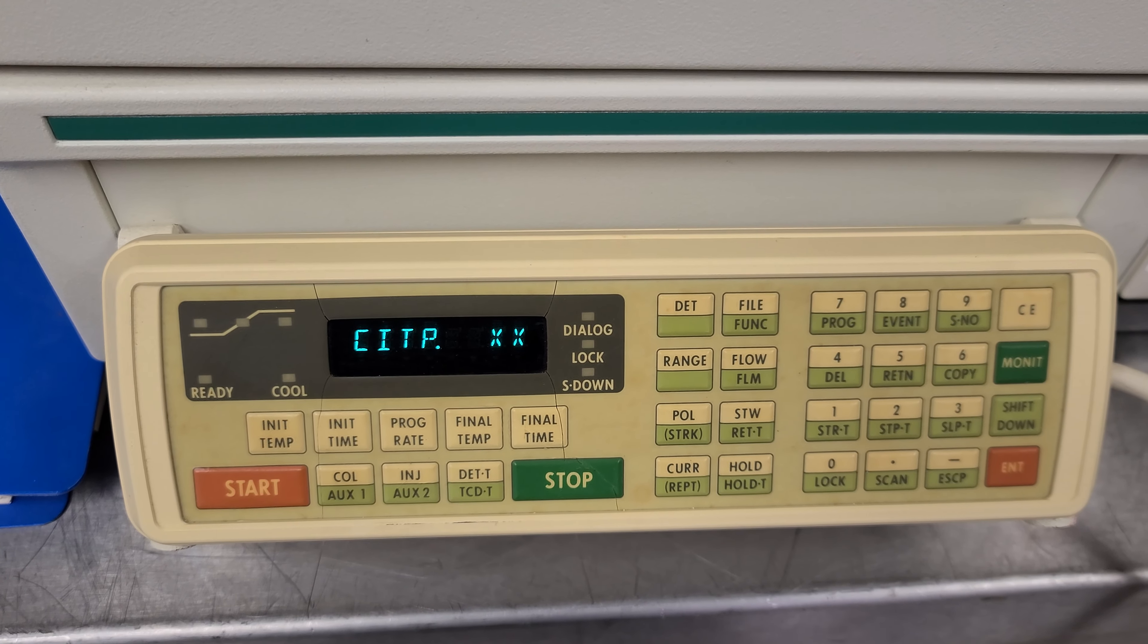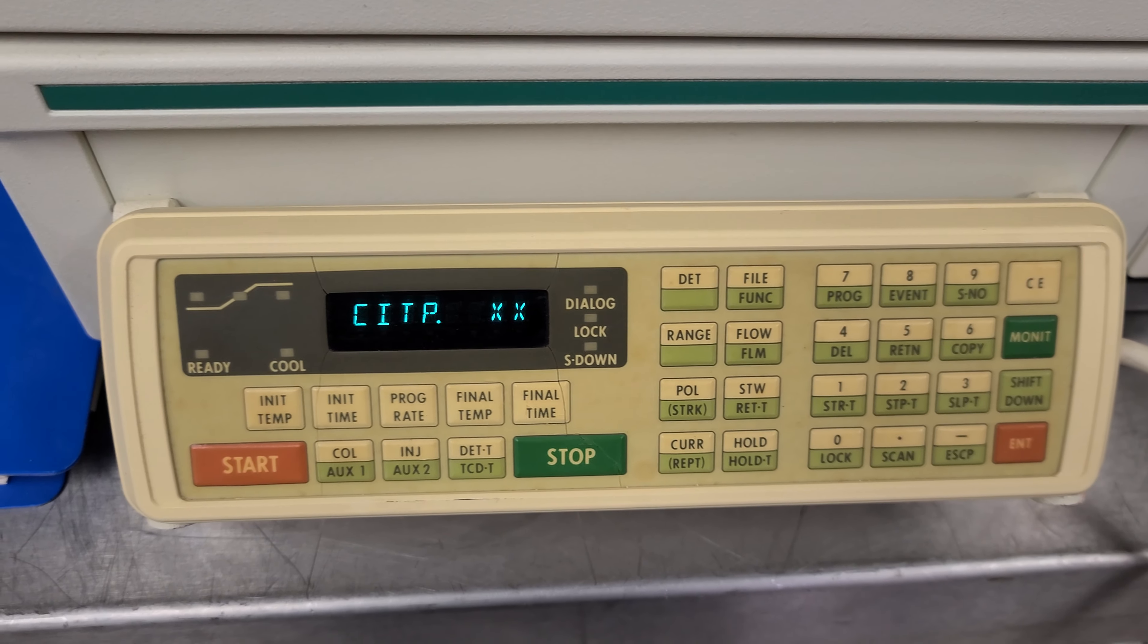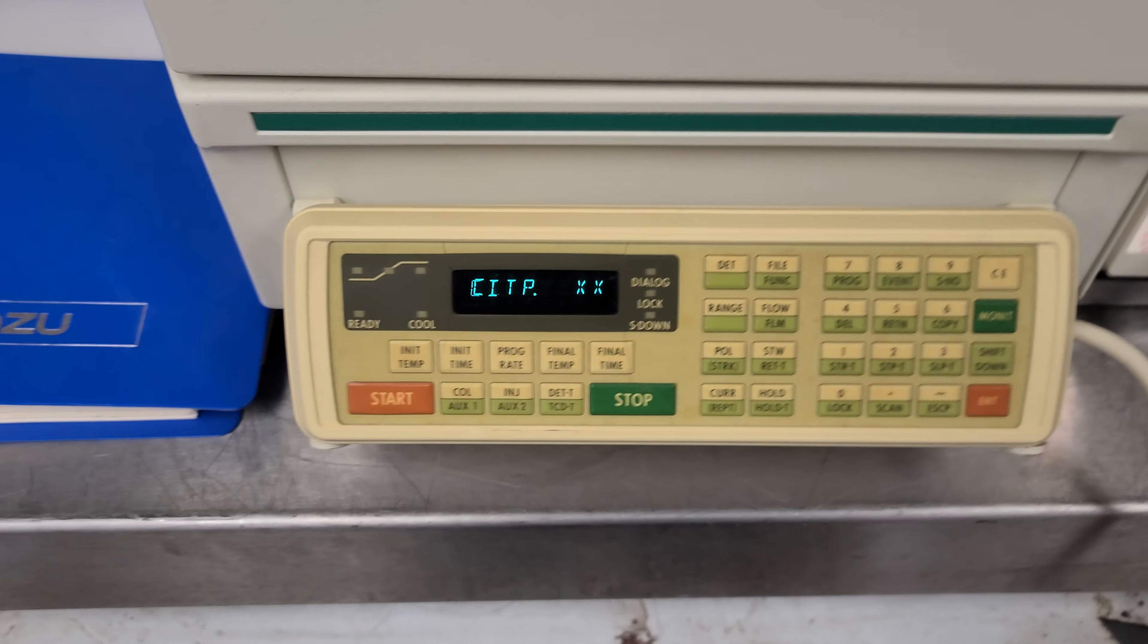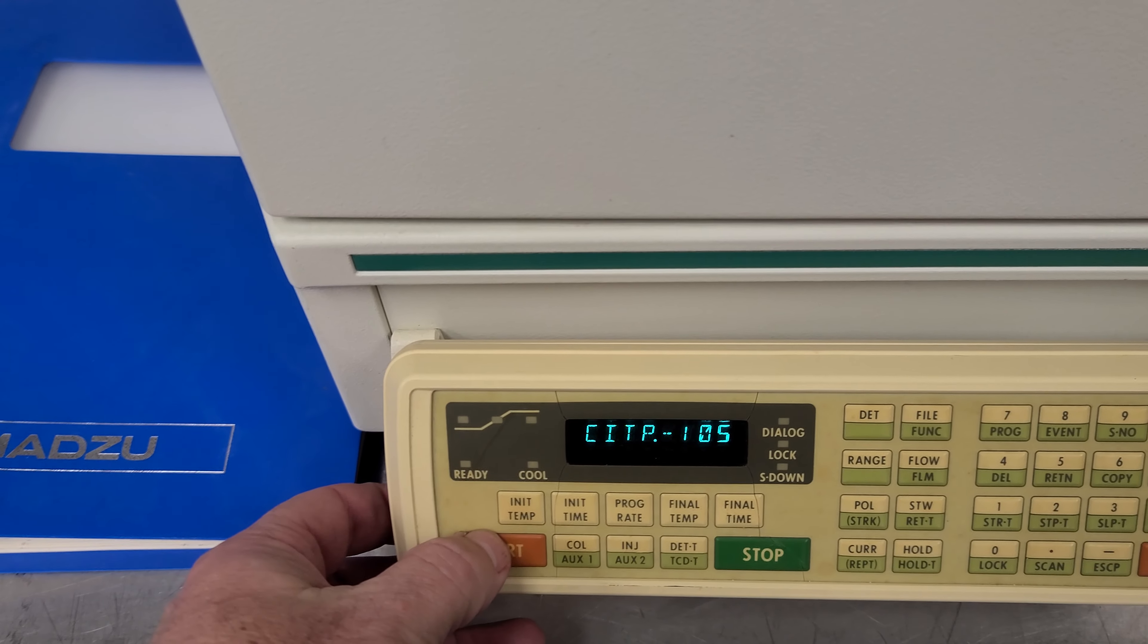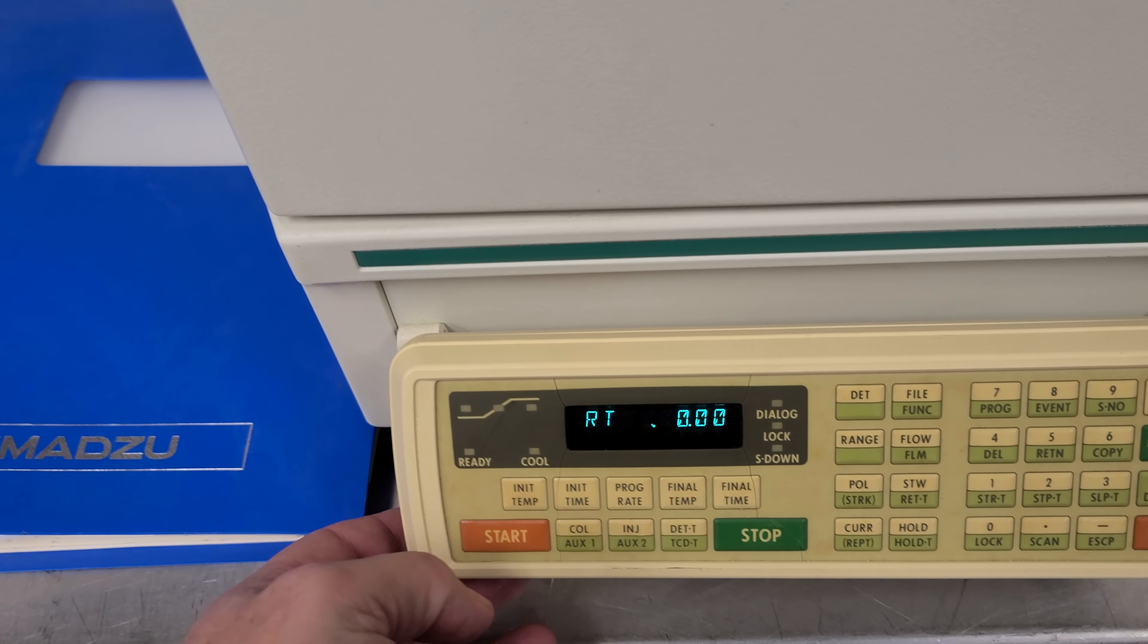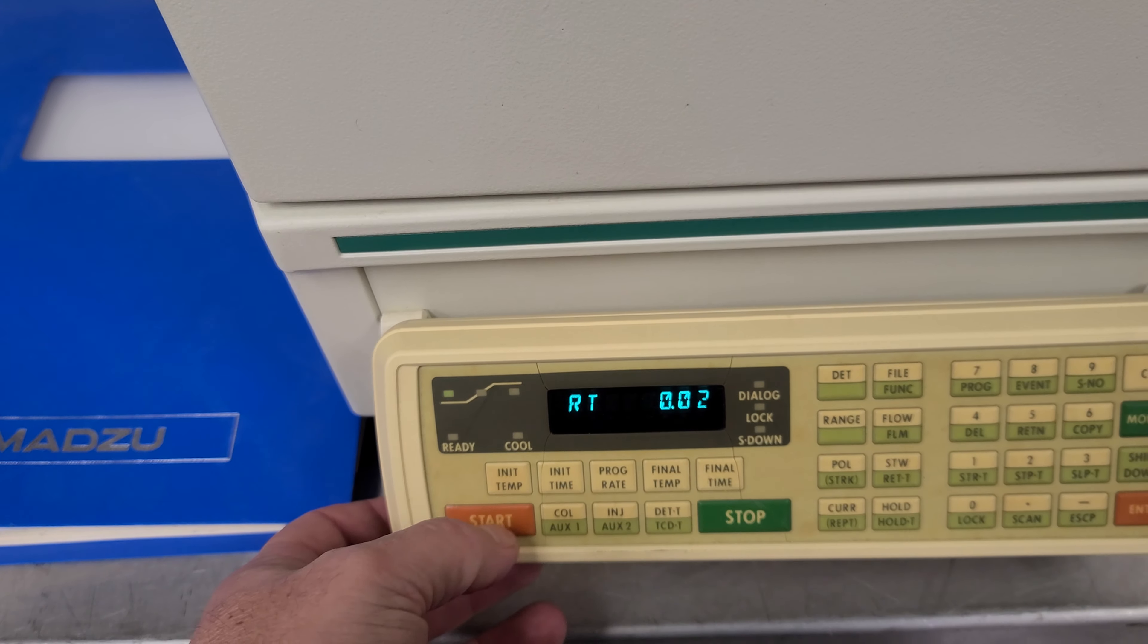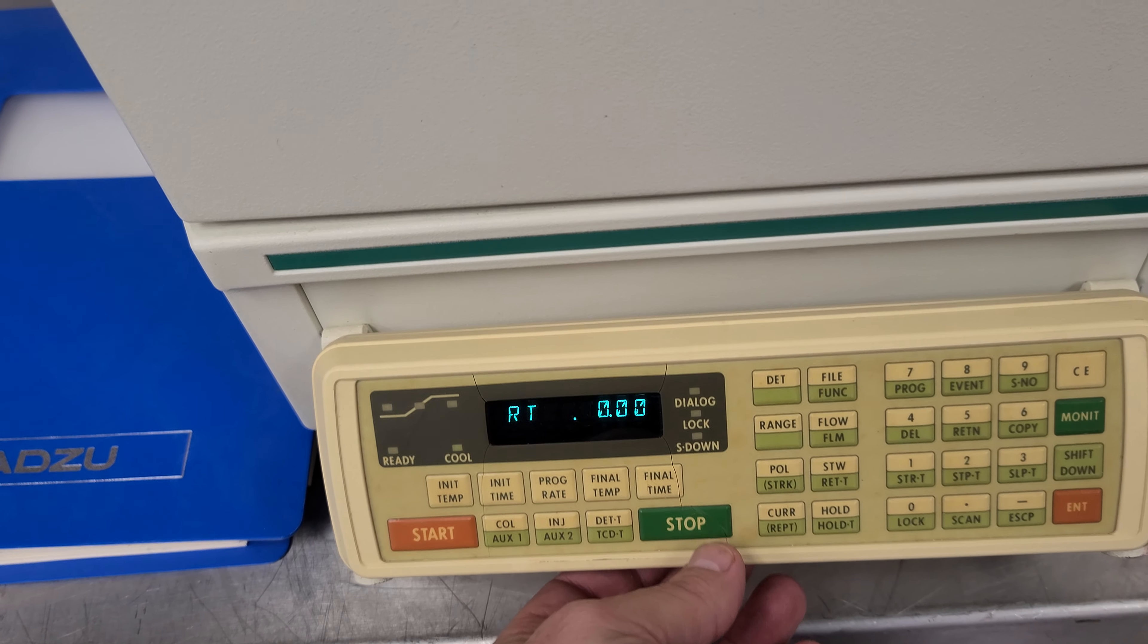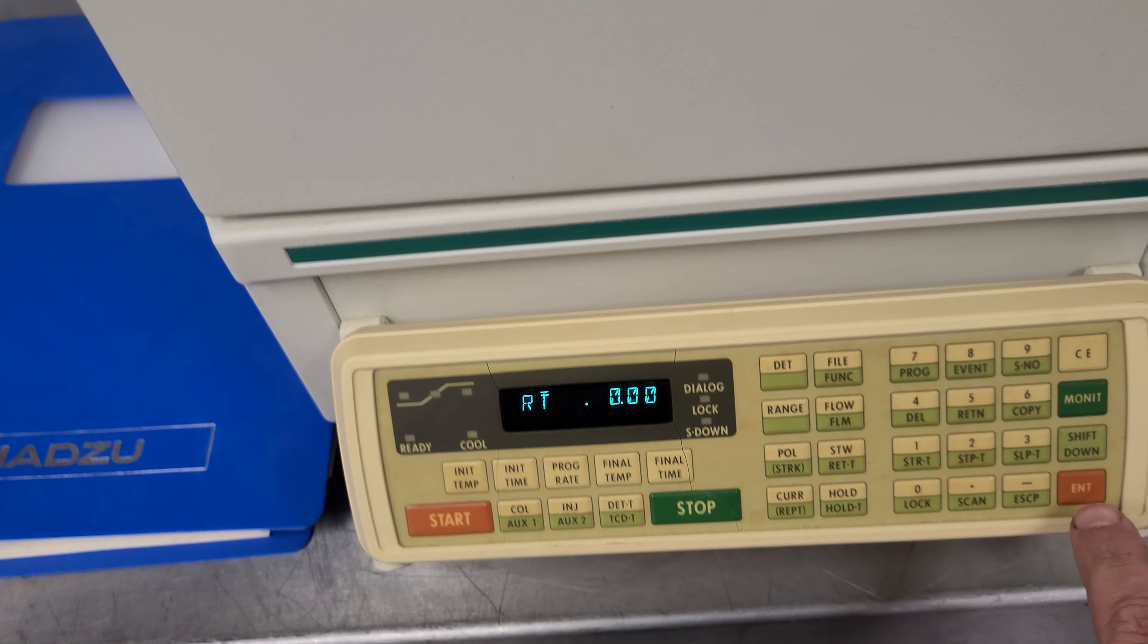It says C-I-T-P. I think that's all it does. If I hit start... don't know what I'm doing.